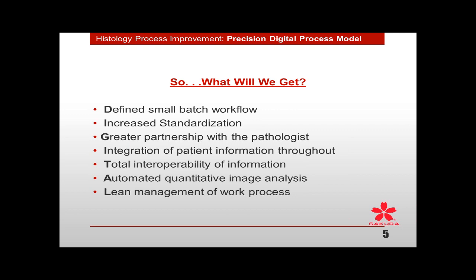You're going to have a better integration of your patient information throughout by barcoding, by integrating and connecting all of your reporting software, your LIS software. You're going to be able to pull all of this information together throughout your system instead of, which is typical, at the end. This also means that you're going to have a lot more data to deal with. So you're going to have to start trying to understand just exactly where IT can help you and how you can better partner with it.